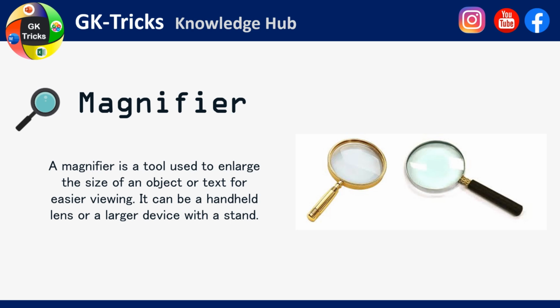Magnifier. A magnifier is a tool used to enlarge the size of an object or text for easier viewing. It can be a handheld lens or a larger device with a stand.